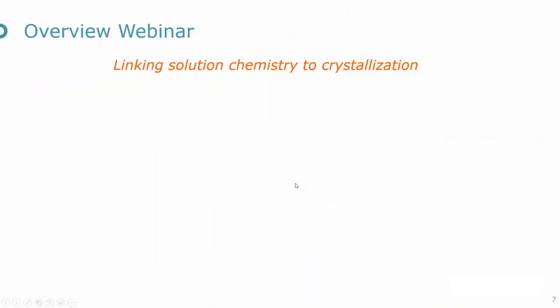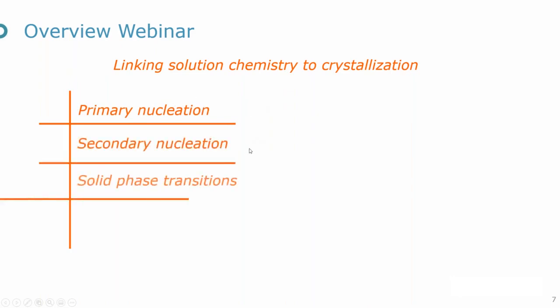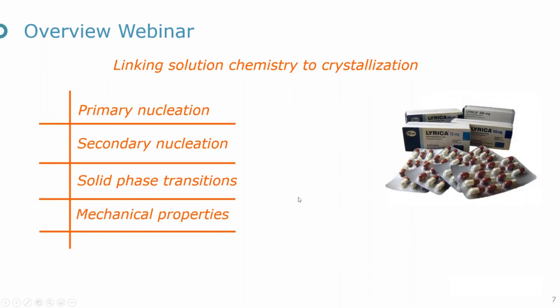So the science part of my presentation is on linking solution chemistry to crystallization, and this is a really broad topic. So I will focus on a few things, namely primary nucleation, but I'll also discuss secondary nucleation, solid phase transitions, and mechanical properties of the final API. And the main compound that I will discuss is Pregabalin, which is also known as Lyrica, which is made by Pfizer.